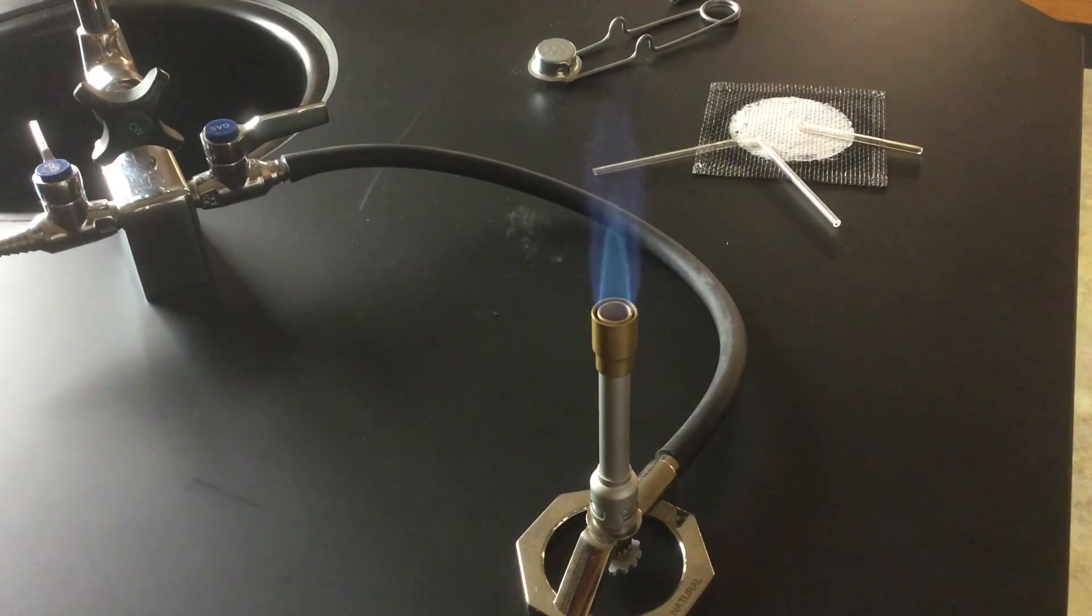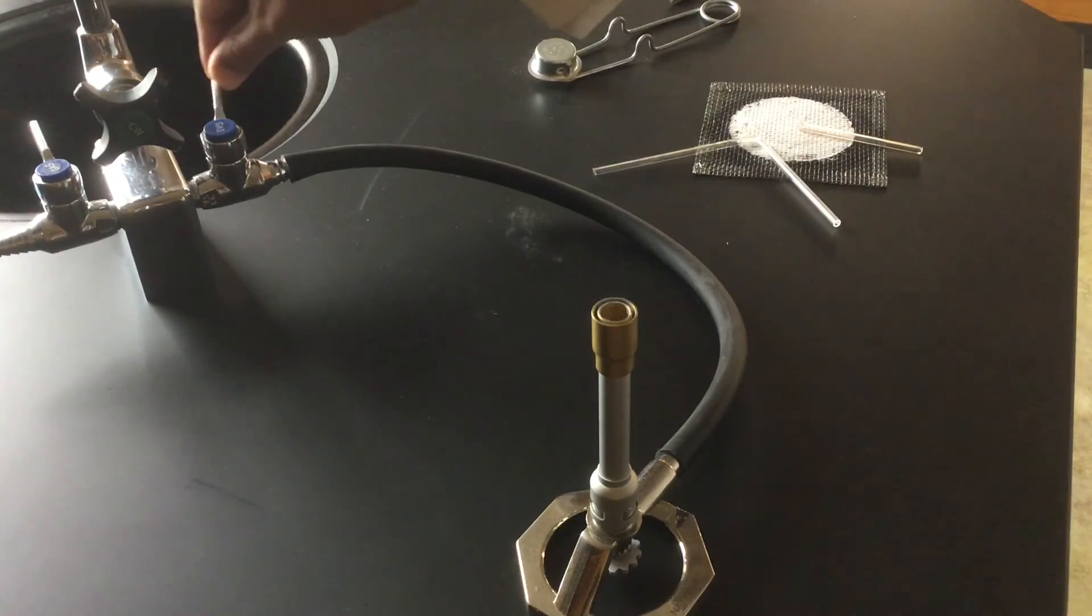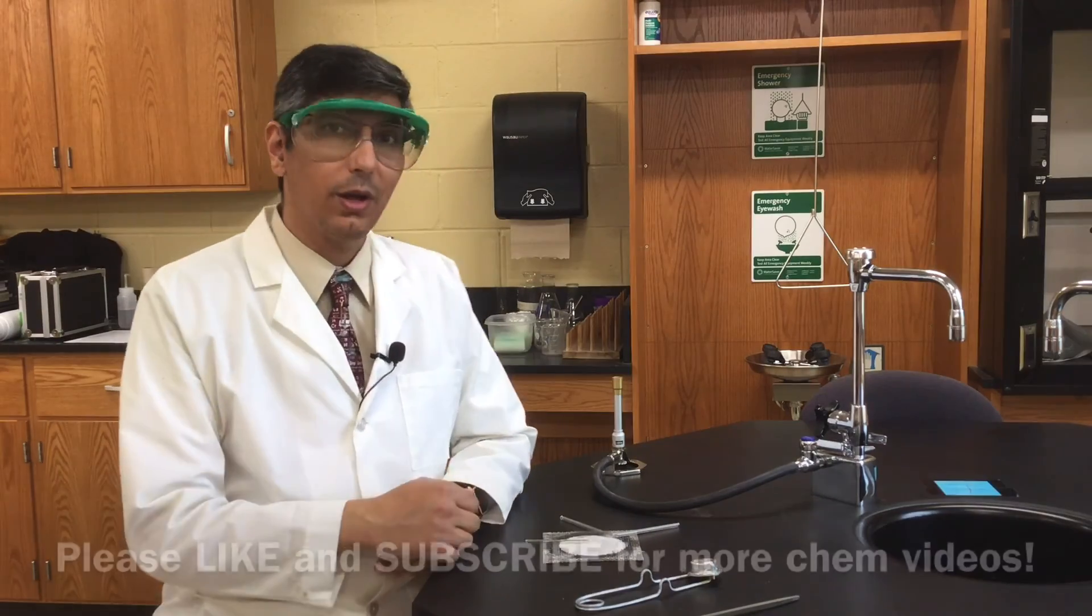When you're finished bending and cutting and fire polishing your glass, you can turn off the Bunsen burner flame right here at the jet. And that's it. That's how to fire polish glass and bend glass using a Bunsen burner or sometimes as we call it a Terrell burner.